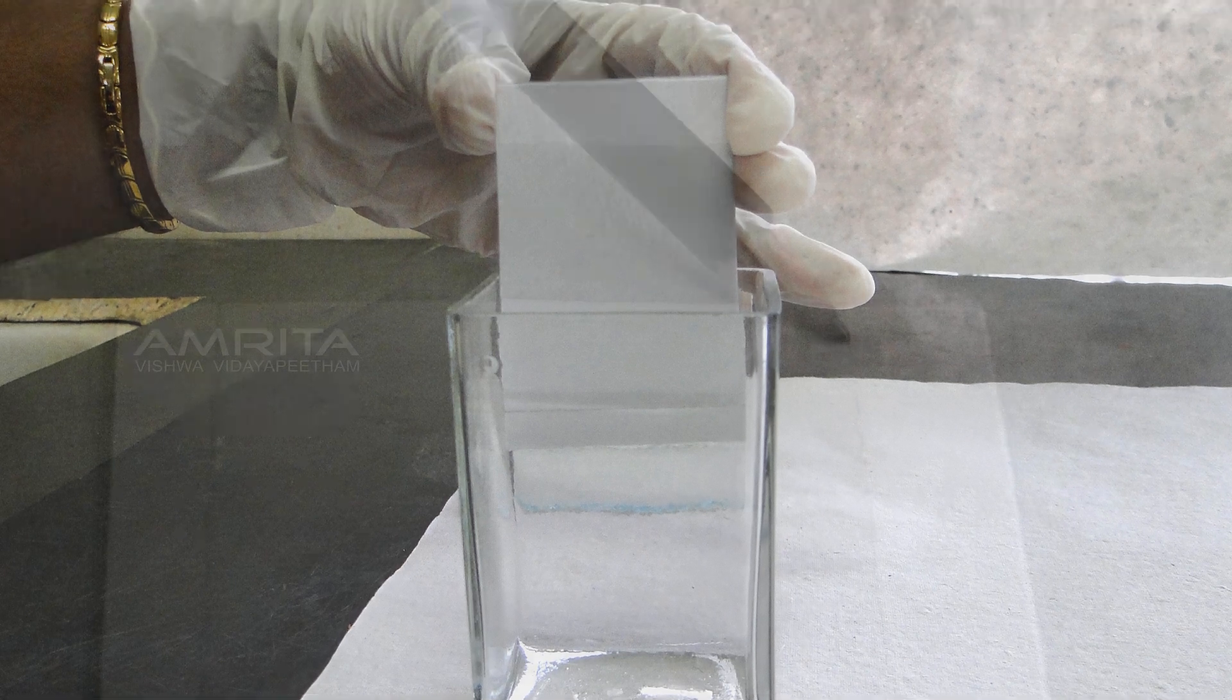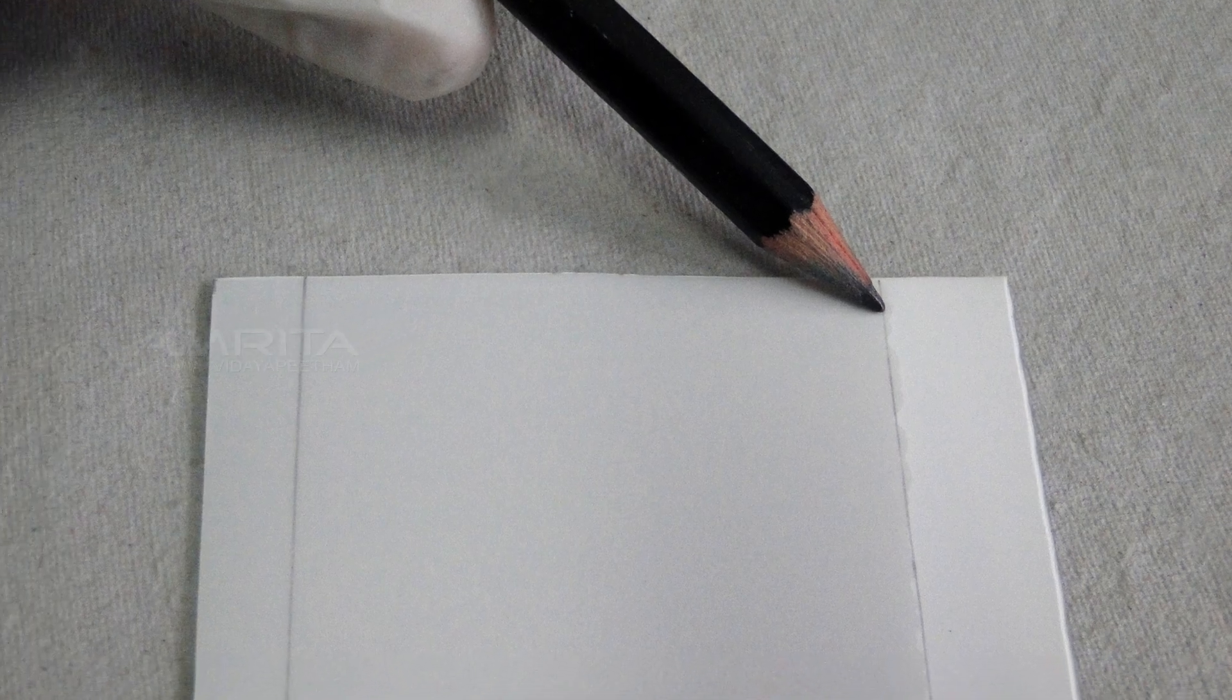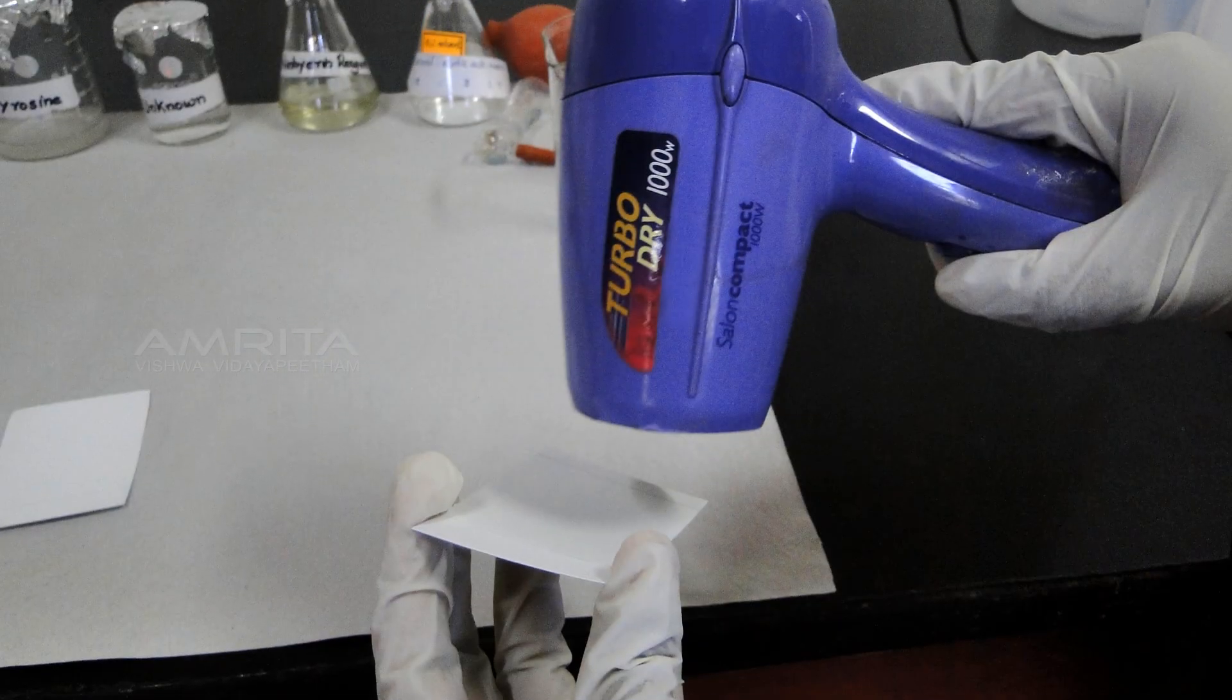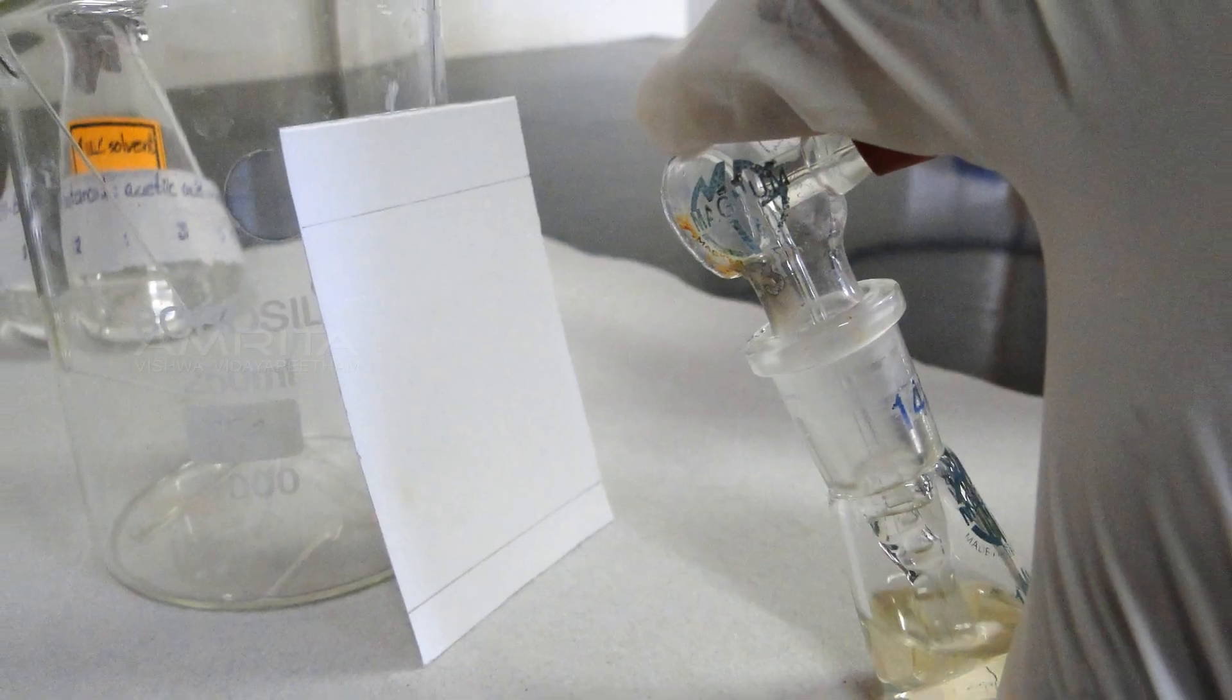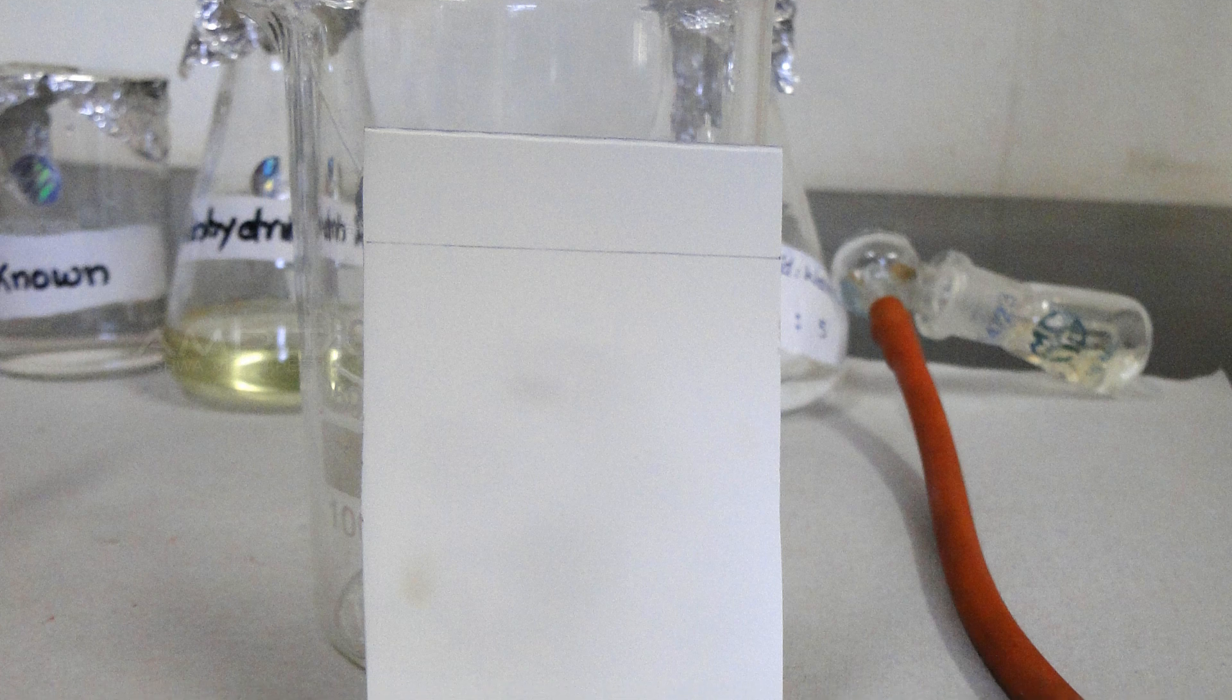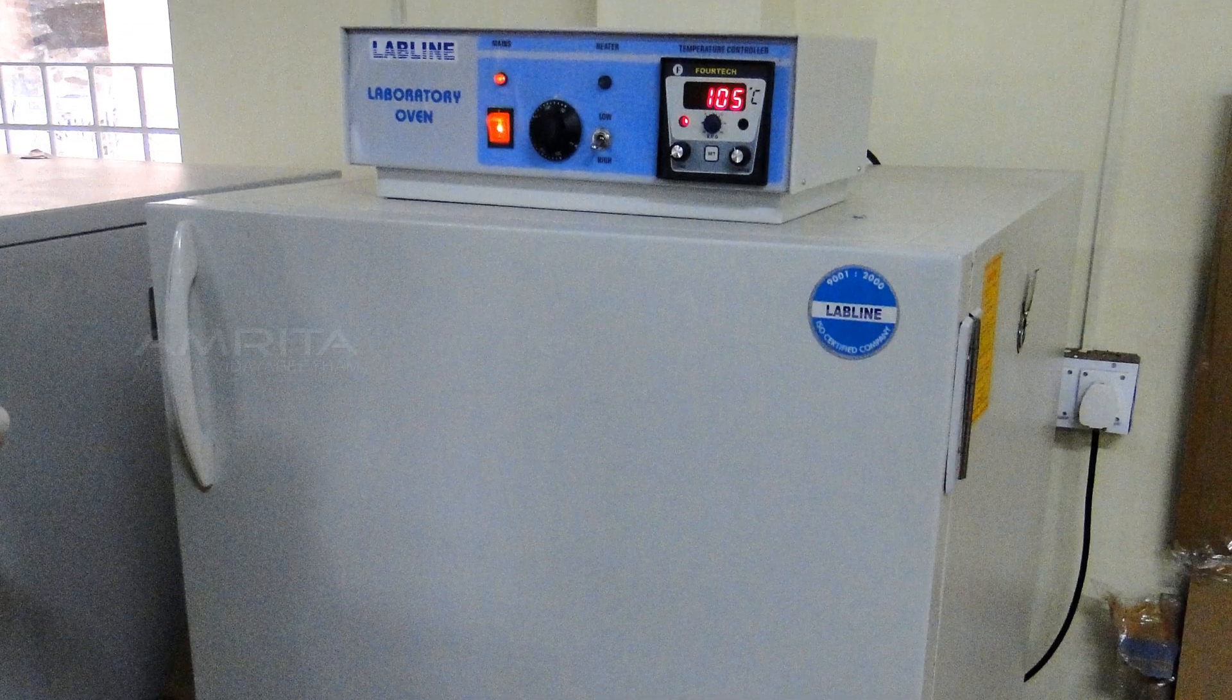Remove the plate and immediately draw a line across the solvent front. Dry the plate with the aid of a blow dryer. Spray the dry plate with ninhydrin reagent. Dry the plates in hot air oven at 105 degrees Celsius for 5 minutes.